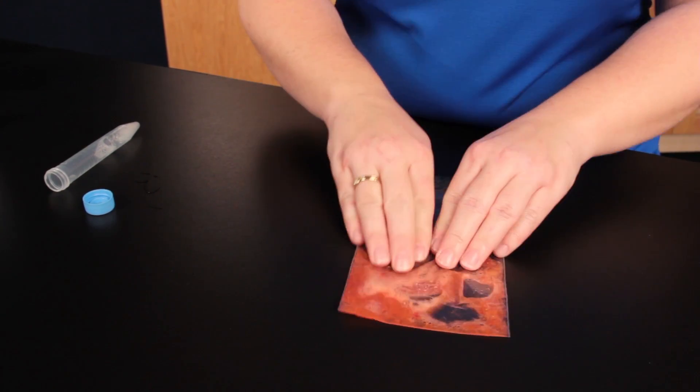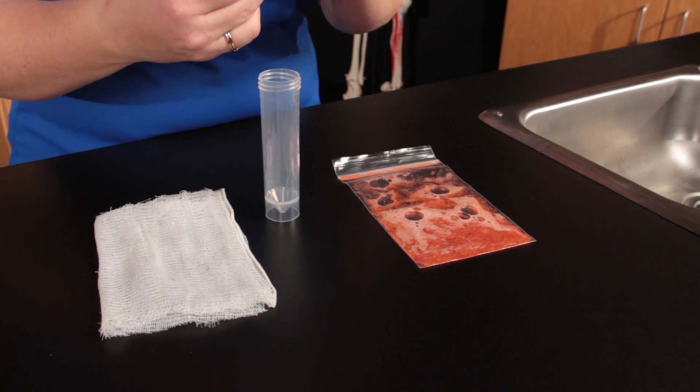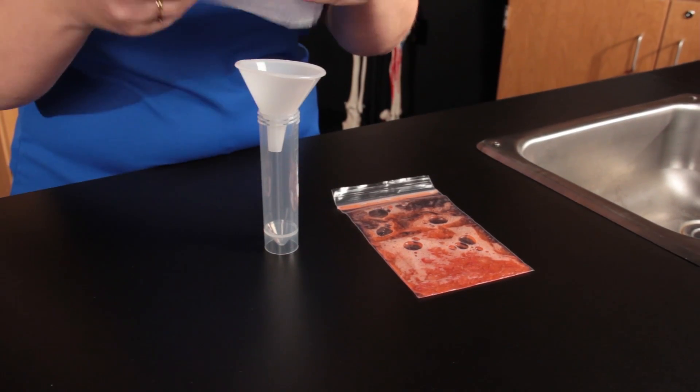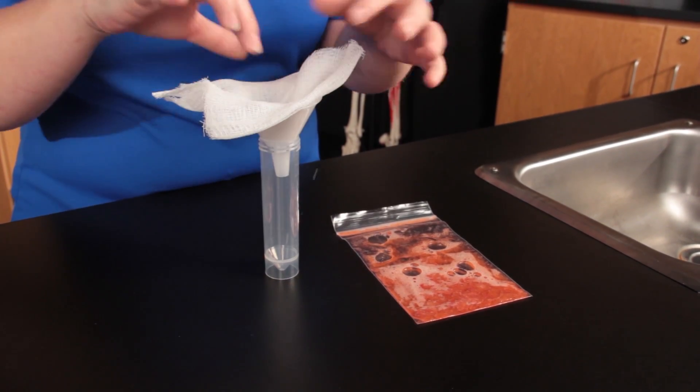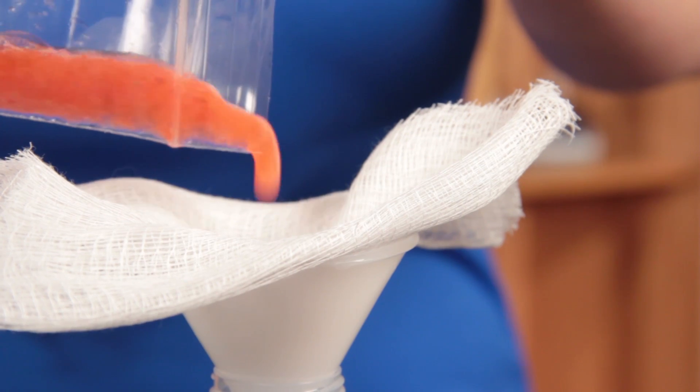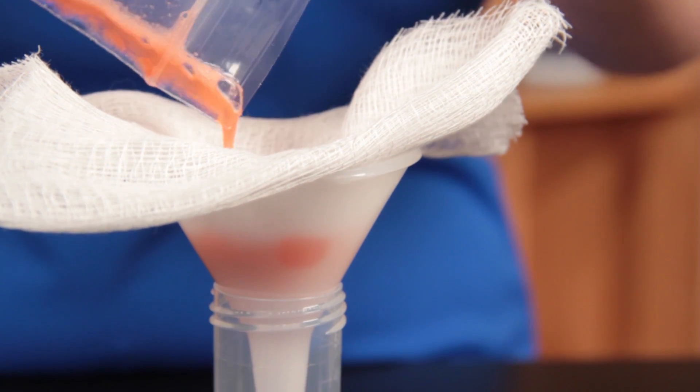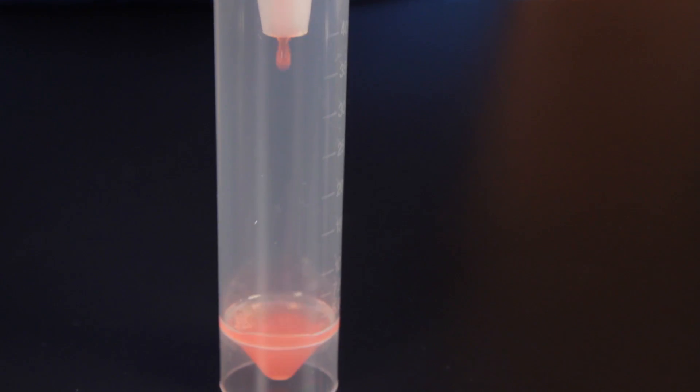To filter, place the funnel in the cup, then line the funnel with one or two layers of cheesecloth. Now pour the mixture over the funnel and allow it to filter into the vial. Discard the cheesecloth into the plastic bag.